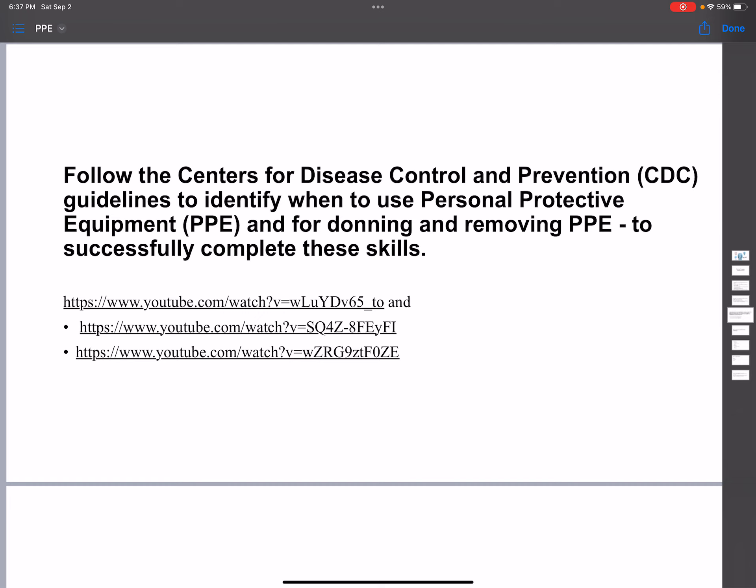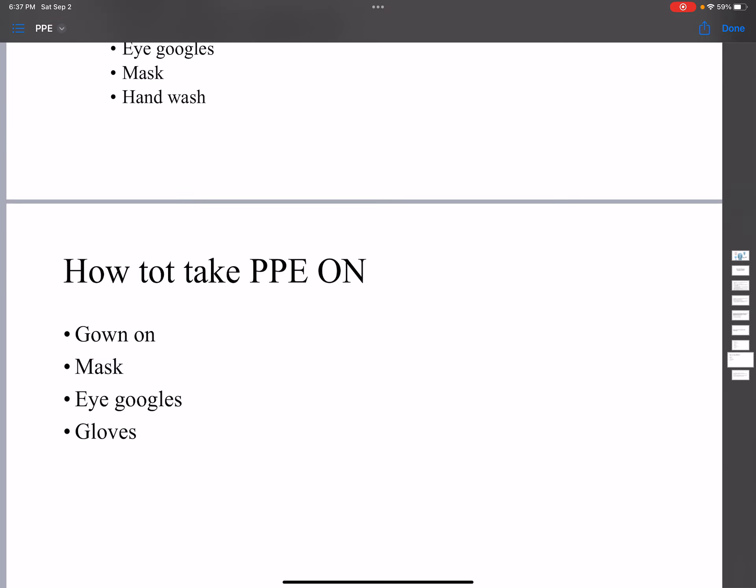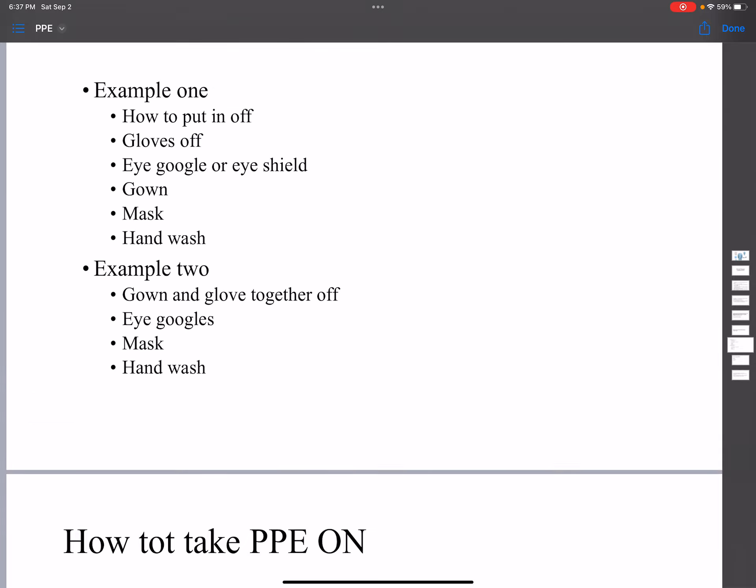We need to follow CDC guidelines on how to put PPE on and take it off to avoid spreading infection. Generally, in 2023, the CDC says you need to put your gown on first, then your mask, then your eye goggles, and then your gloves.